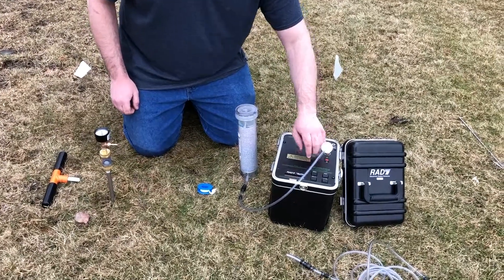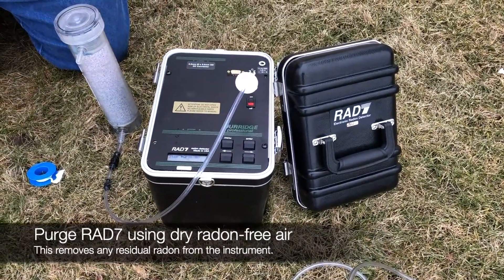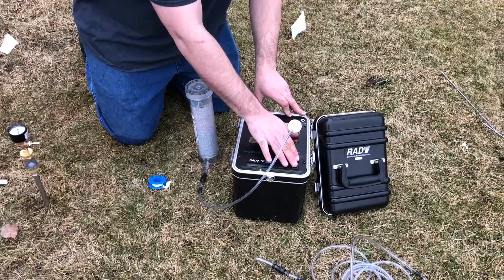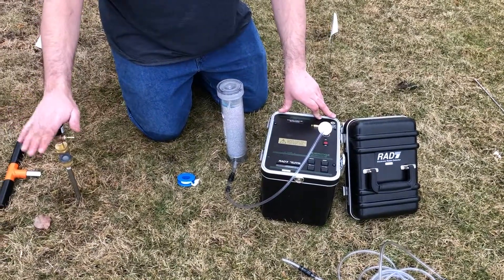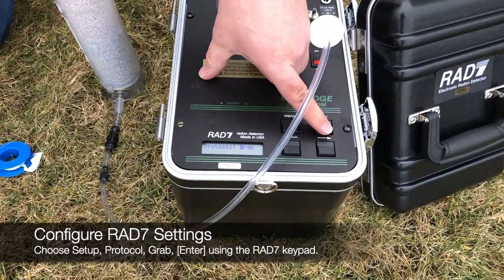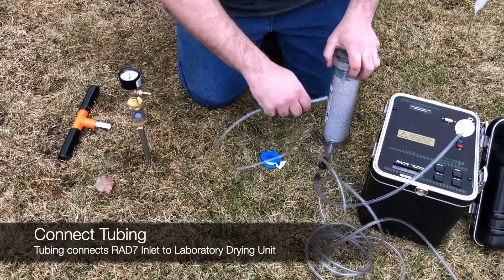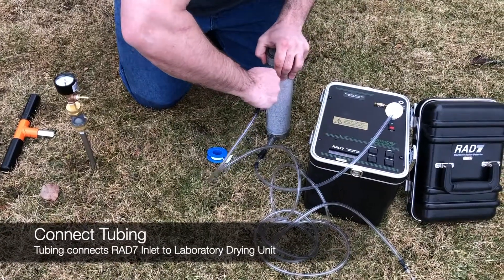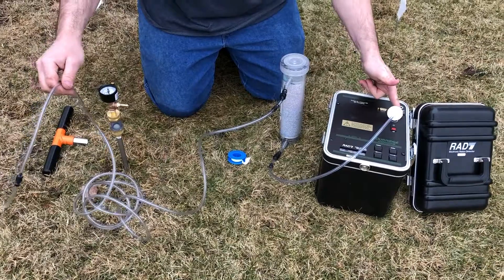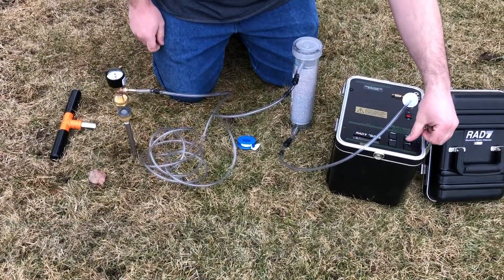Before we do any testing, one thing we have to make sure of is that the RAD7 is purged for a while using dry, clean air. In this case, I've already pre-purged it, so we can move on with our tests. To set up the RAD7 for testing with the soil probe, we have to set the protocol to grab. After that, take your tubing, attach it to the drying column, attach the drying column itself to the inlet of the RAD7, and the other end of the tube to the probe. From there, we can start the test.